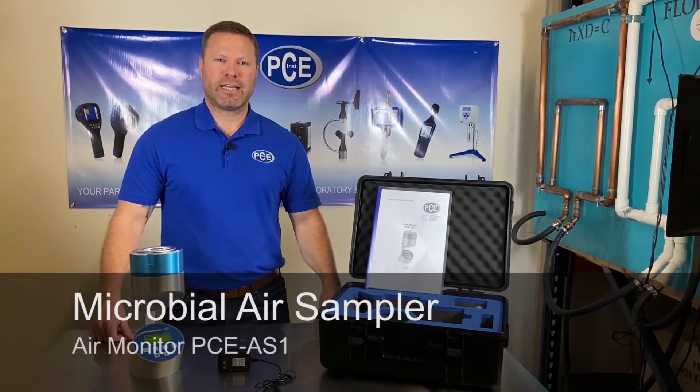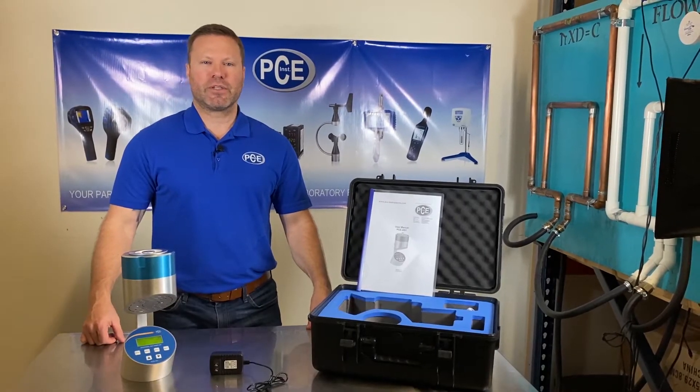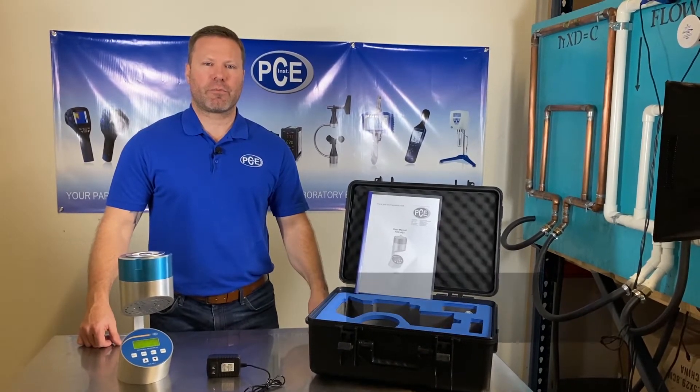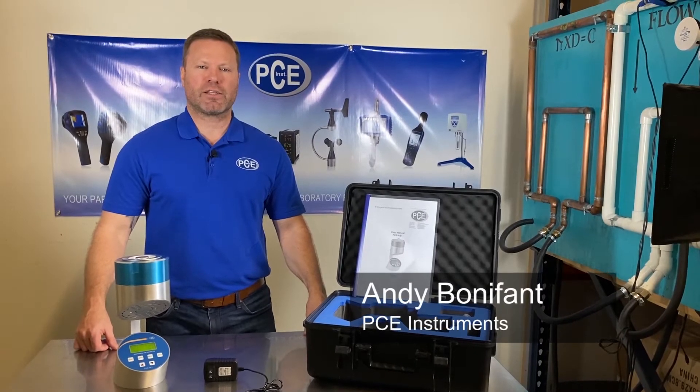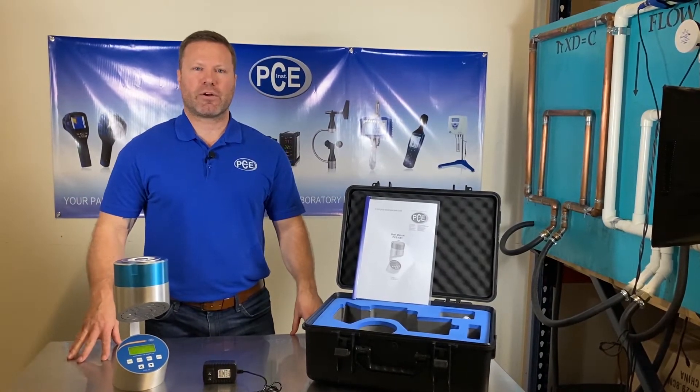Hi there, I'm Andy with PCE. Today we're going to be looking at the PCE AS1 air sampler. It's used in the hospital industry, the pharmaceutical, clean rooms, as well as the food and beverage industry. It's used for checking the fungal counts and the air quality.